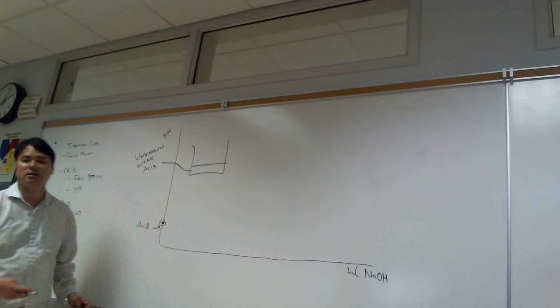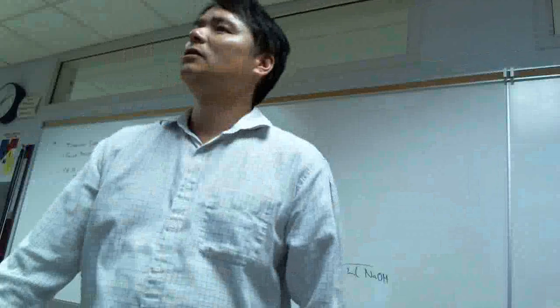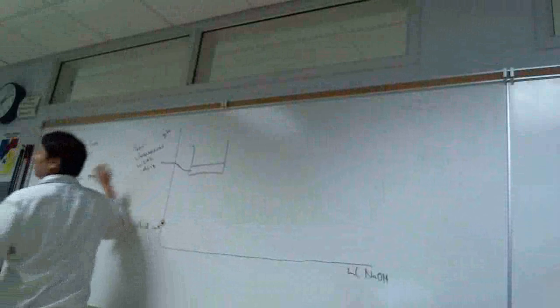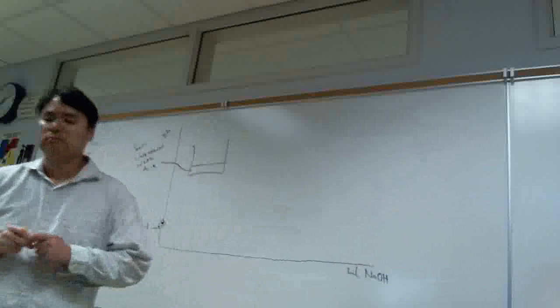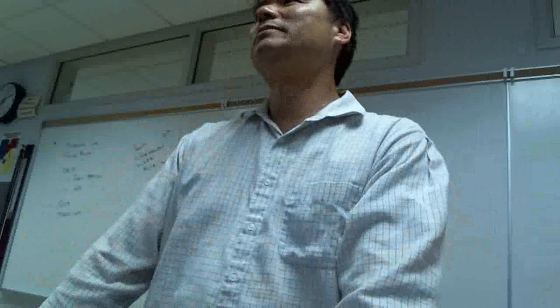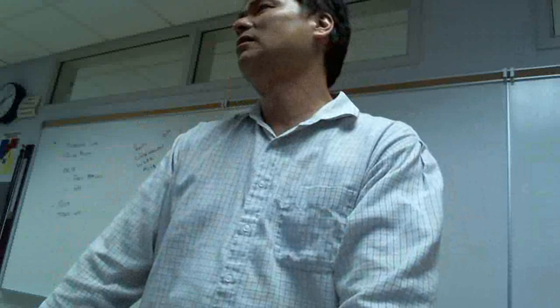So the first thing is, does the pH of the acid depend on how much water you add? The unknown acid itself is a solid that we weigh out. And so does the pH of a solid unknown acid depend on how much water we add? Yes.